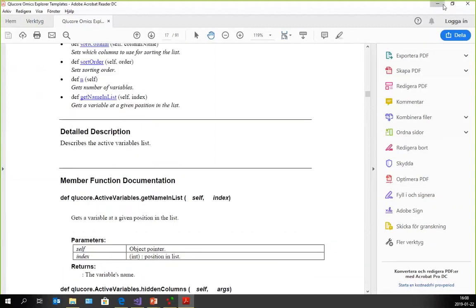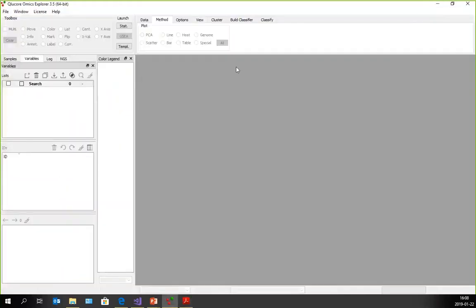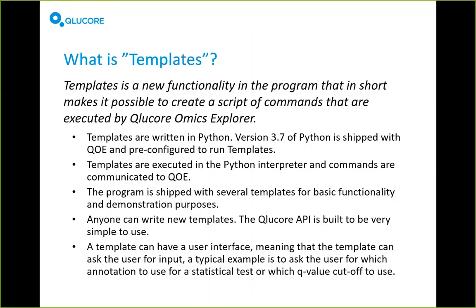Most of the commands are built up in a very similar way. The commands you use to control a template are built in a way so that they're very intuitive to use. I'll show that when we get to the source code for a template and see what this can do for you.